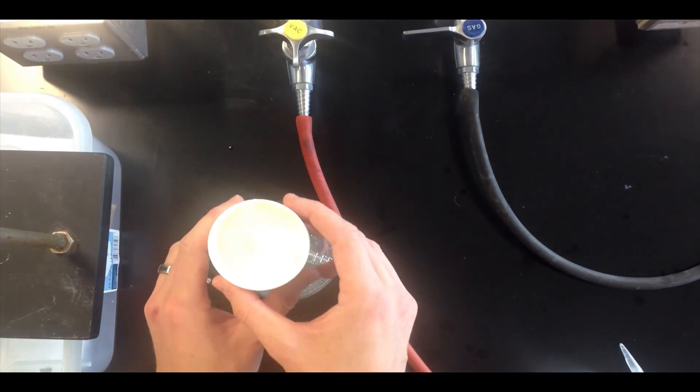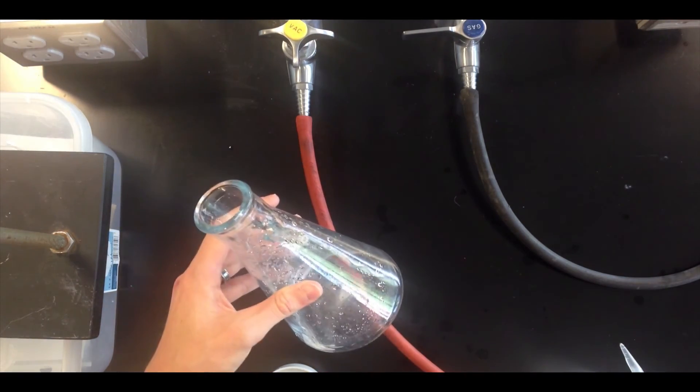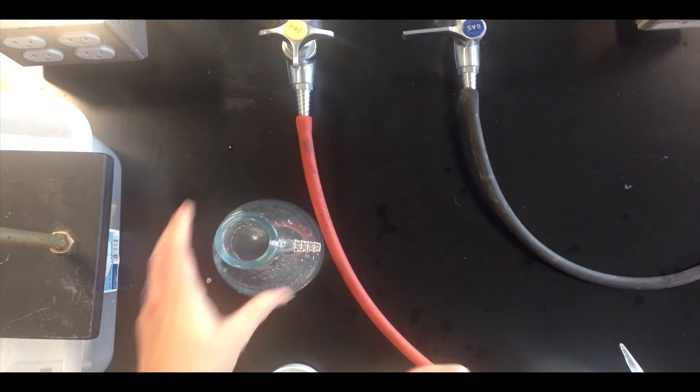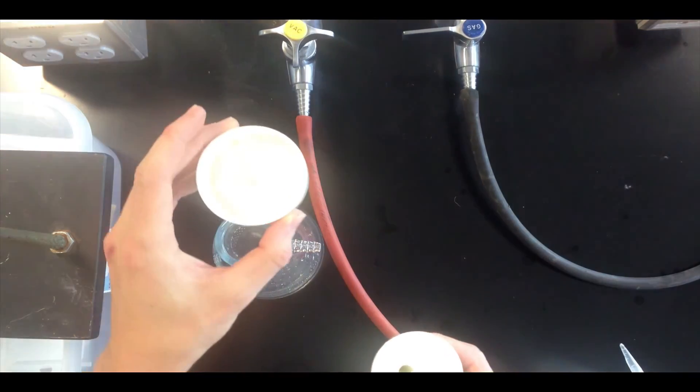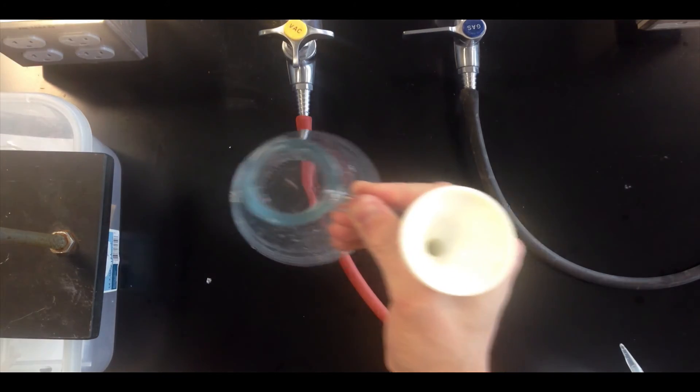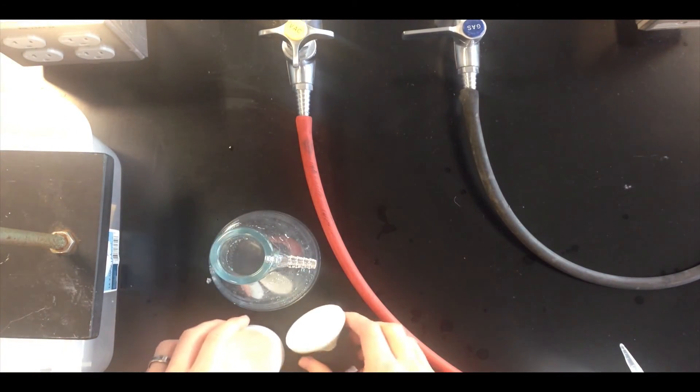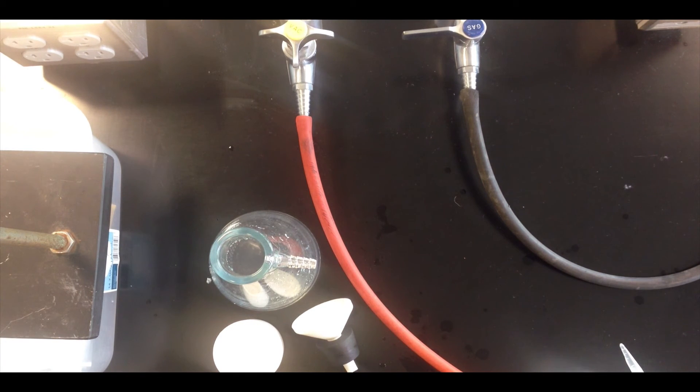If you need the filtrate, you can discard the solid, remove the stopper, and pour off the filtrate. If you need both, then you can put the solid in one beaker and put the filtrate from the filter flask in another beaker. There's a lot of flexibility to this method as far as getting out of it what you want or need.